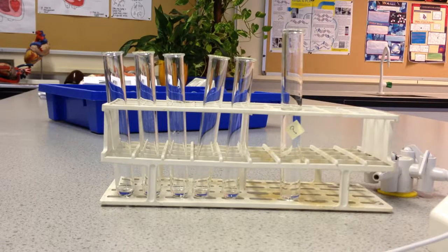And then to all of my standard solutions, I add the same volume of Benedict's reagent.